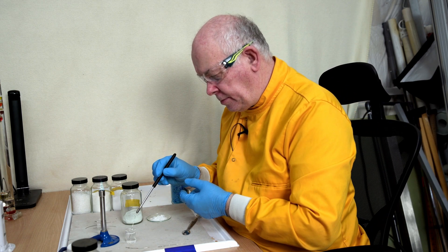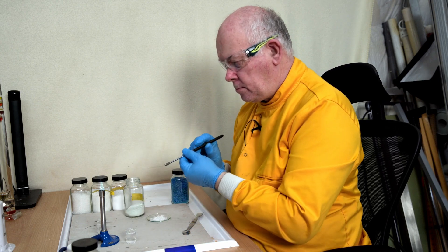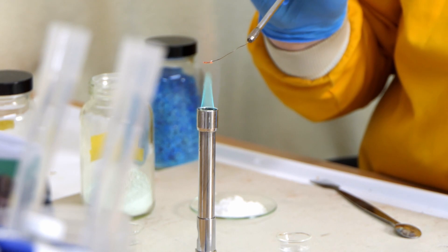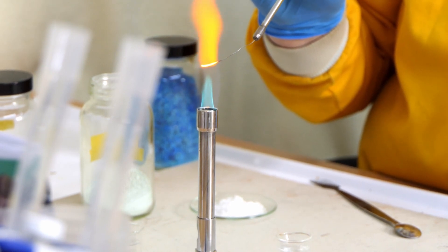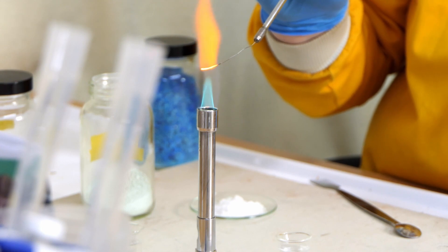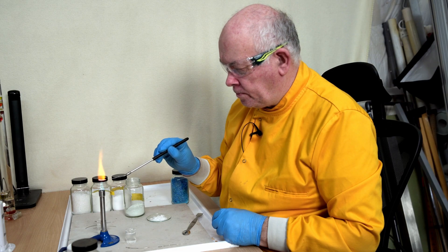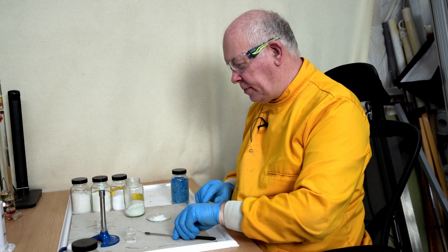I might even try a different white powder - now this one is one that fools many people. Let's try some of this white powder now. Can you see a blue in there at all? There should be - just there.